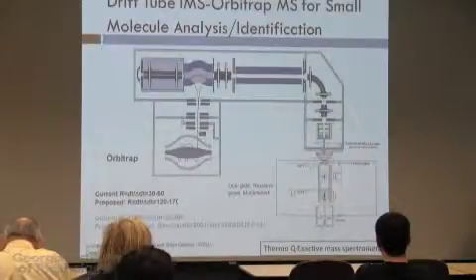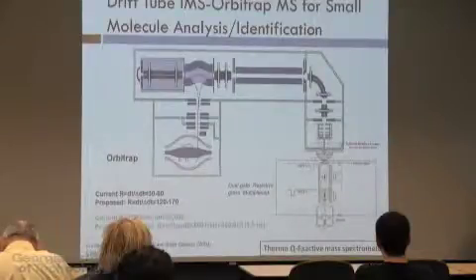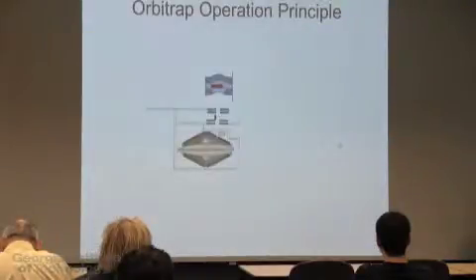It's much better, okay? Coming back to the Orbitraps, they are really changing the landscape in terms of mass spectrometry, and if you paid attention, the new facilities in EBB are going to have Orbitrap mass spectrometers. Orbitraps are Fourier transform mass specs. So basically, you take your ions, you shoot them into this Orbitrap, and this Orbitrap, to give you an idea, is about this big. Okay, so it's not a monster instrument, the mass analyzer.